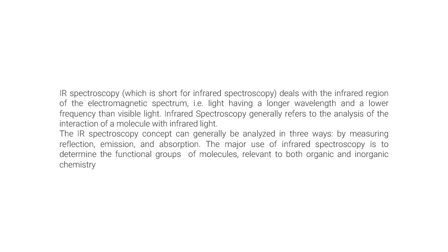In this, we strike infrared light and we study the behavior of molecules with it. We study transmission or absorption. The infrared spectroscopy concept can generally be analyzed in three ways: by measuring reflection, emission, or absorption.